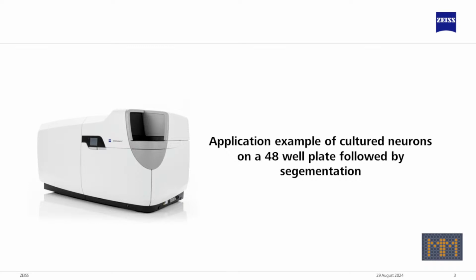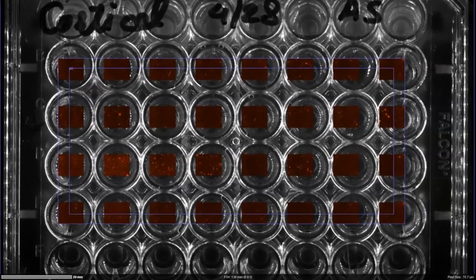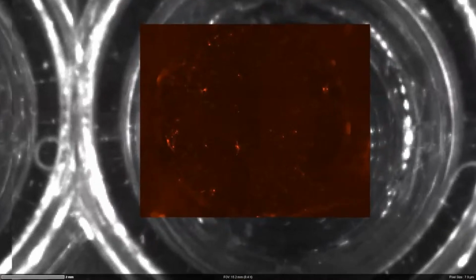So over here, I just wanted to give you an example of cultured neurons grown on a 48 well plate. So as you saw in the video, we can image across multiple formats, be it a 24, 48, and so on and so forth. And I'll just show you an example of a video playing from a ZEN Connect project, which is essentially a project file that keeps all of the images in context from overview to detail.